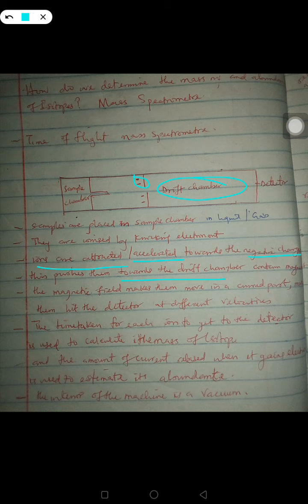Now what happens in the drift chamber is that once the ions move away from the negative charge and enter into the drift chamber, they slow down. Not exactly slow down, but their movement is controlled by certain particles, which I'm going to talk about. Now the movement is no longer linear, it is a curved movement.